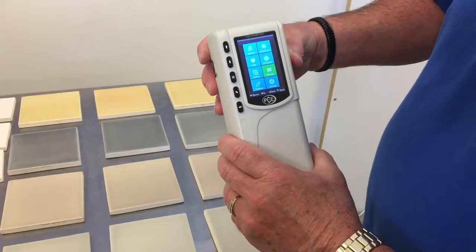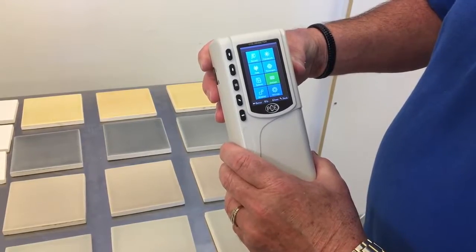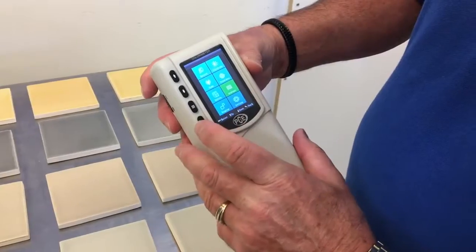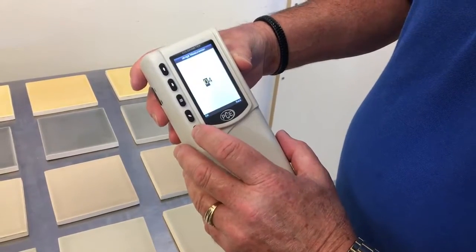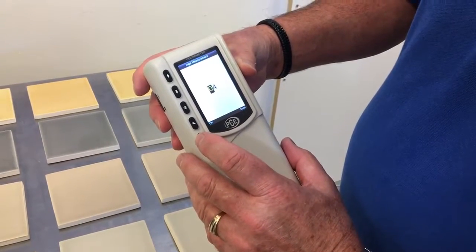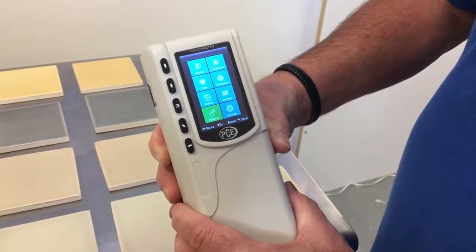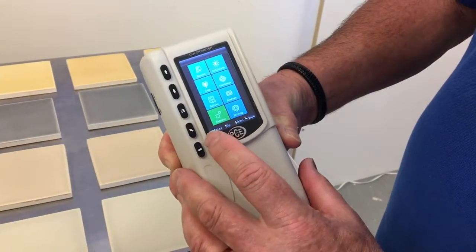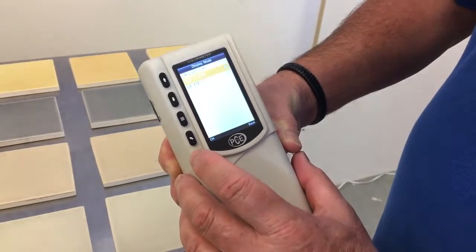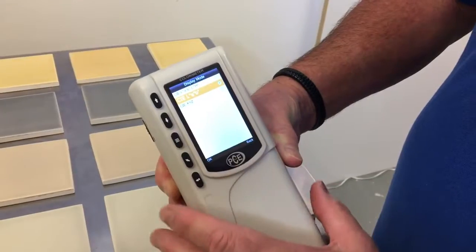We are going to set the number of measurements we are taking on the sample. To do that we go into the menu and to average. Enter. It's set at zero — we set it to four, so four times on each sample. The PCE CSM1 color meter is able to measure in three different color spaces. I pick CIE LAB.